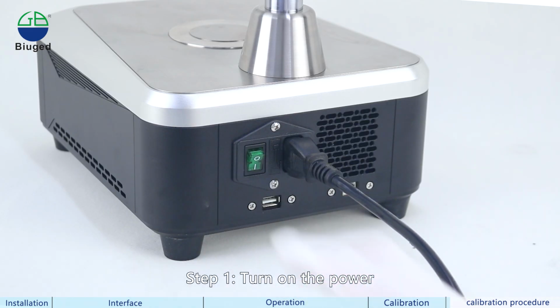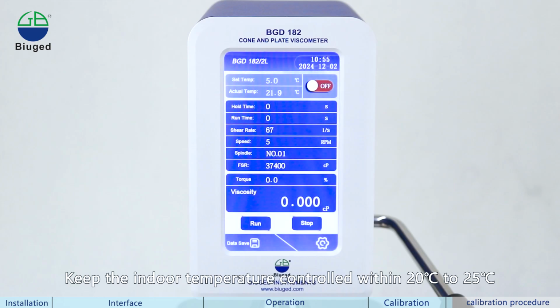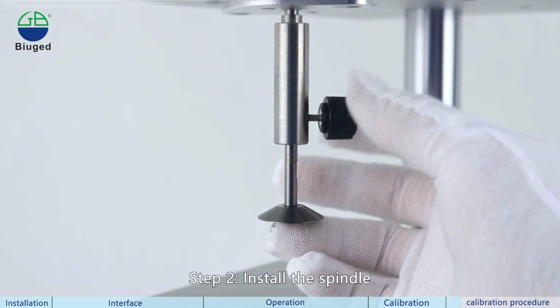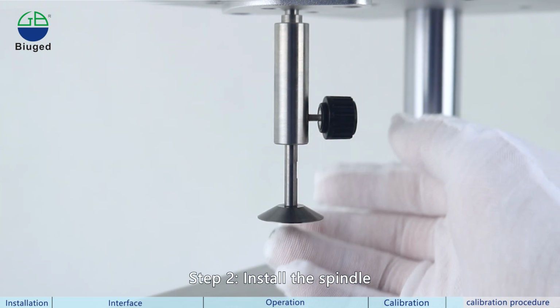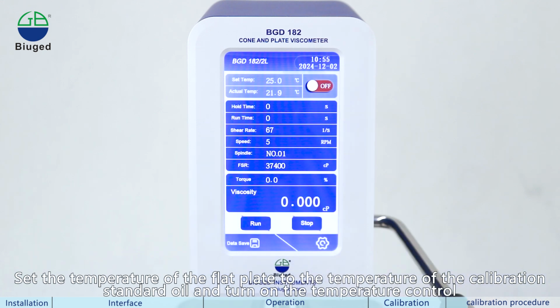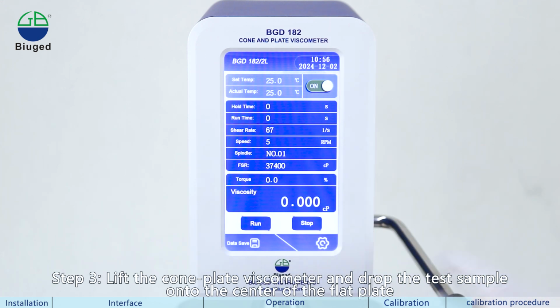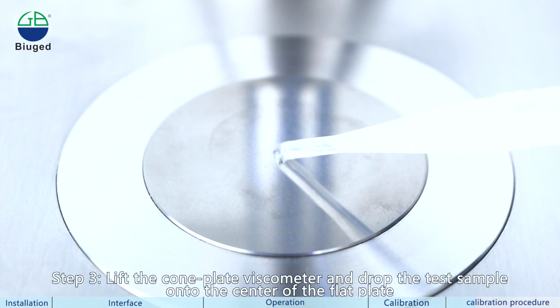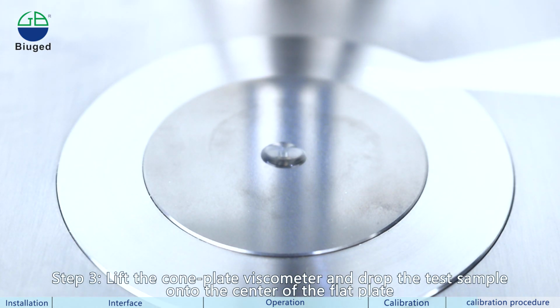Step 1. Turn on the power. Keep the indoor temperature controlled within 20 degrees Celsius to 25 degrees Celsius. Step 2. Install the spindle. Set the temperature of the flat plate to the temperature of the calibration standard oil and turn on the temperature control.